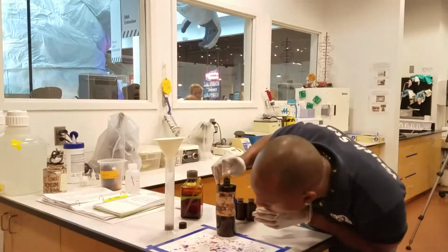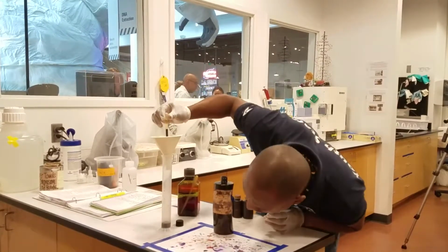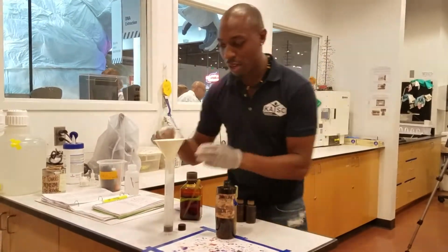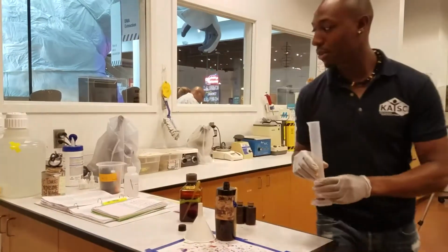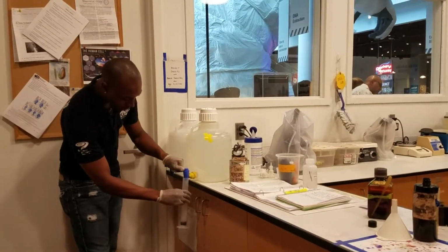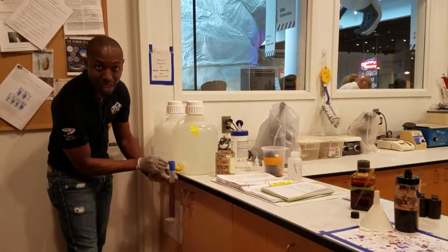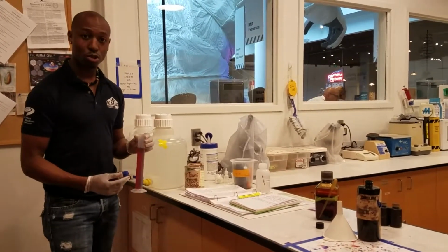And I believe I'm almost there. Nope. Wait. Yeah, there we go. I'm there. Okay, that's that. Once I'm done with that, I'm going to remove my funnel. I'm going to go over here by the distilled water, and I'm going to make sure it goes all the way to 100, and I stop. And this is how you make 10% Lugols solution.